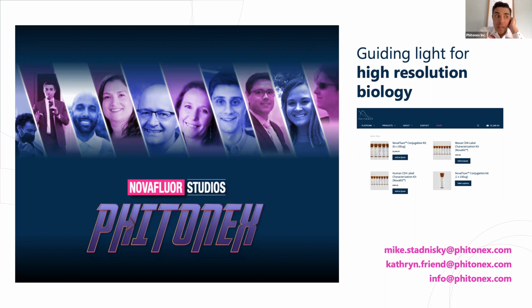Because there are tons of antibodies. I mean, there are commercially available antibodies out there that have been killed based on that conjugation, which I think is shocking. In uncovering that, we've seen a lot more of the underside than I expected. So I'm really hoping that we can have more on that. But now it's just, okay, how do you develop for that? And then how do you also show, for instance, some of this biological normalization, right? I think particularly when you're thinking about multi-omic assays, it becomes really intriguing.